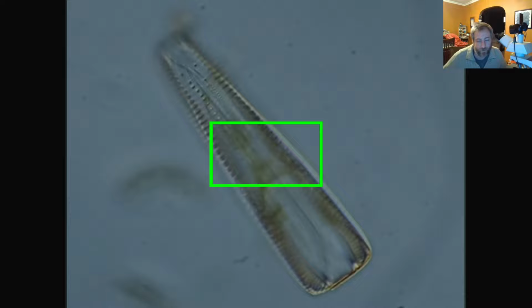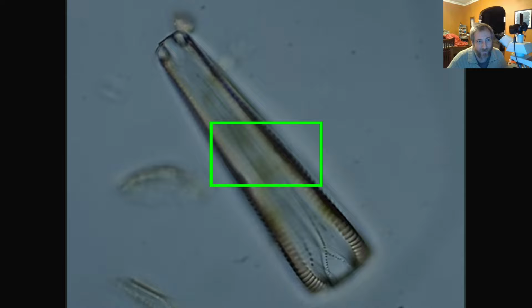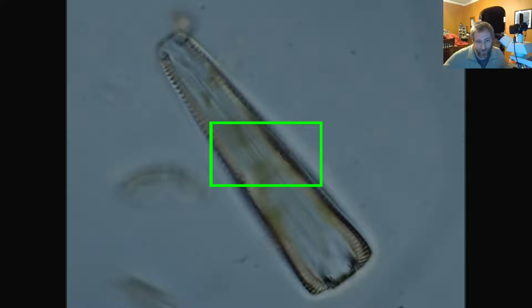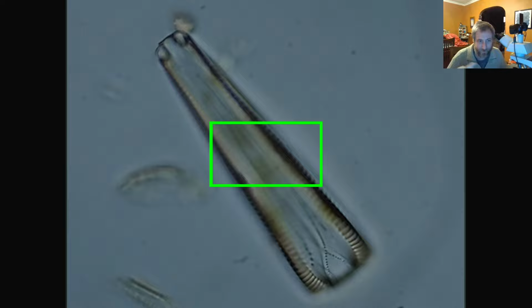And on the other end, if we focus through it, at the top of the picture you can see these little bubble-like structures. They look like maybe little eyes or something, but in fact, those are apical pore fields. They are tiny little pore fields at the base of the diatom. Gomphonema have what we call a head pole, or top side, and a foot pole, which is the bottom side. I can tell the head pole from the foot pole because the head pole always has this prow shape, and the foot pole always has those little fields of tiny pores. You can't actually see the pores in a light microscope, but we see them all the time in the scanning electron microscope. So if you tune in tomorrow, we can look at some of those.